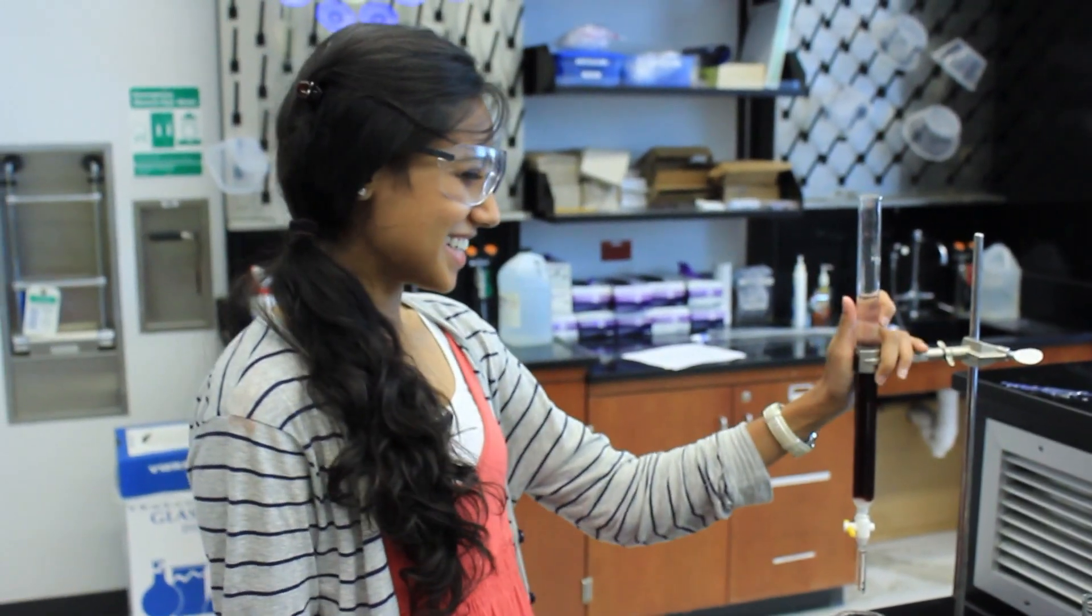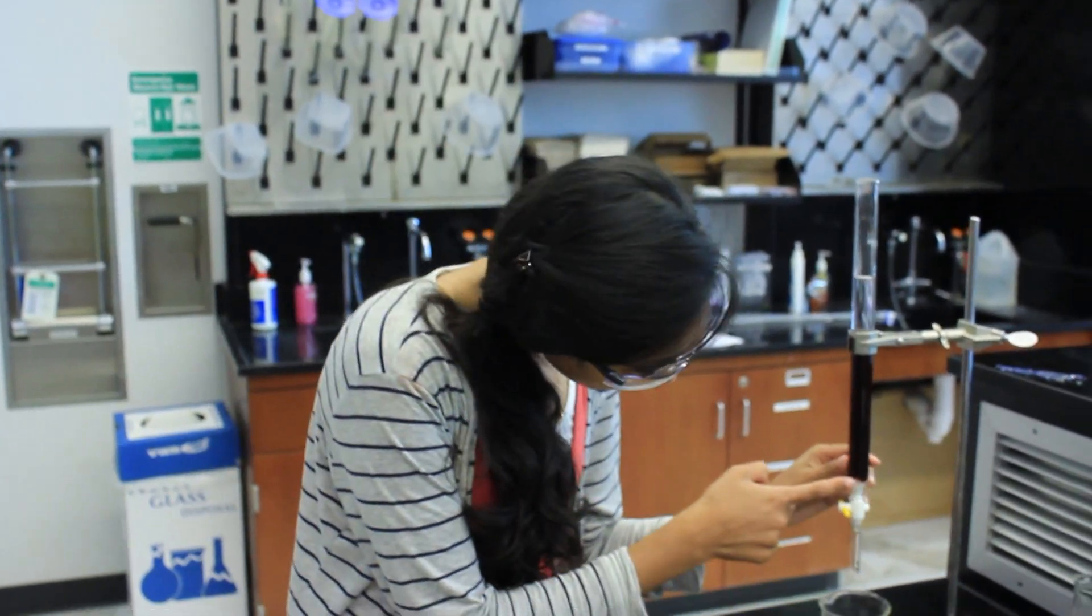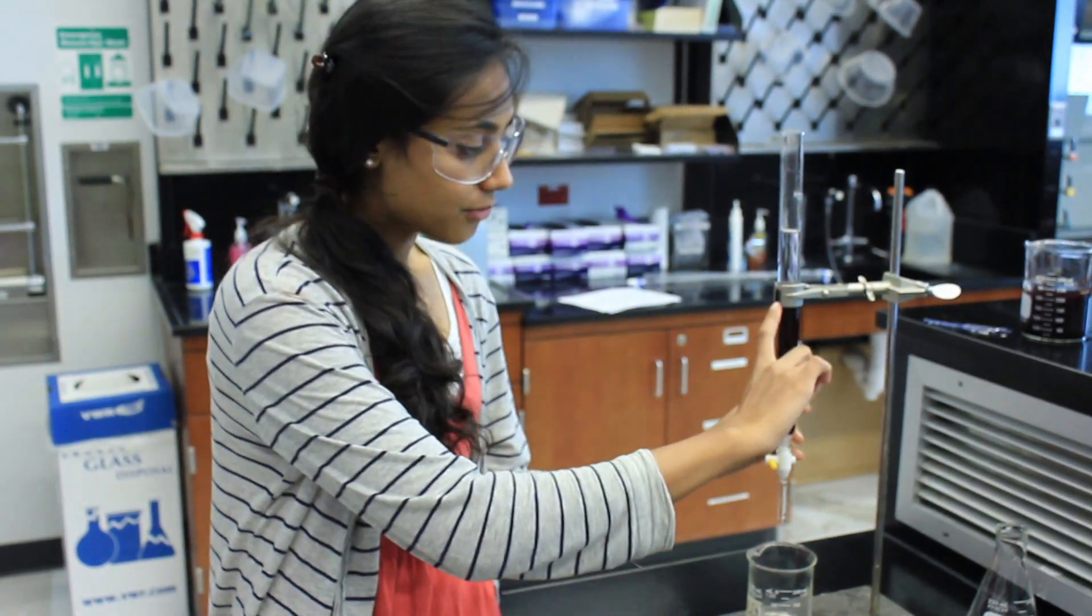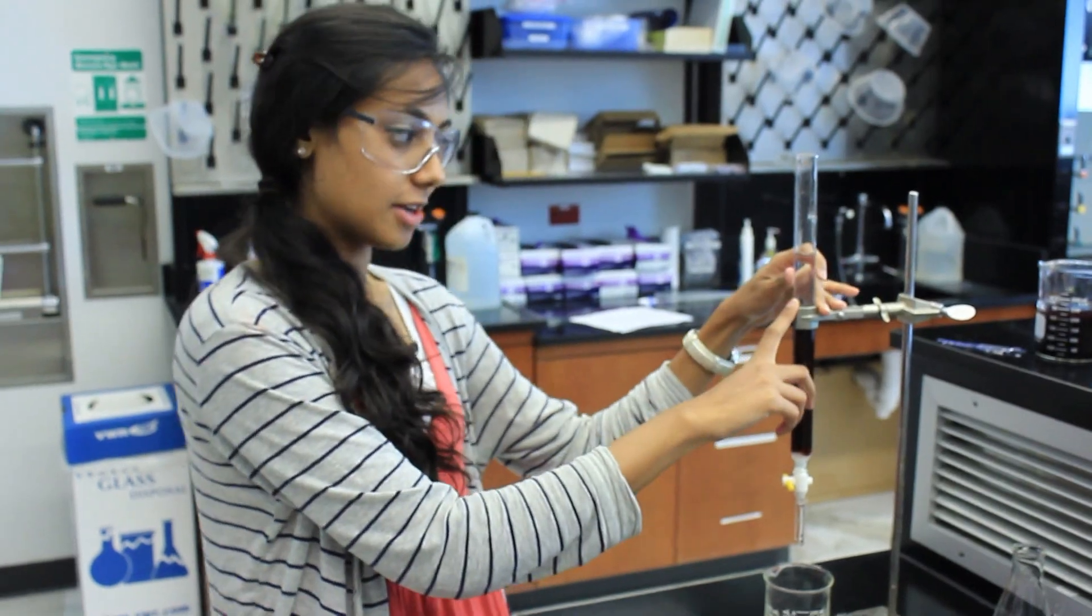Now you have to set up your ion exchange. First you need a column and a stopcock. In the stopcock there's at least 2 centimeters of cotton at the very bottom. And right here is your resin slurry, which your TA will most likely pour into your column for you.